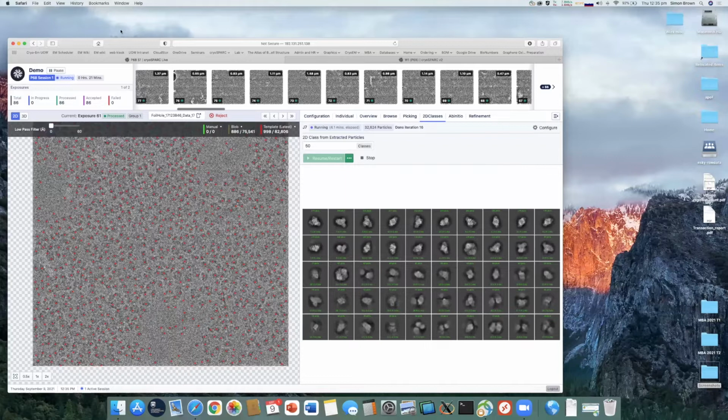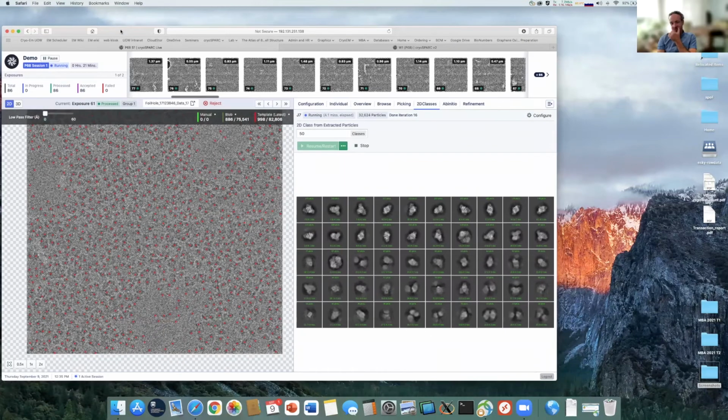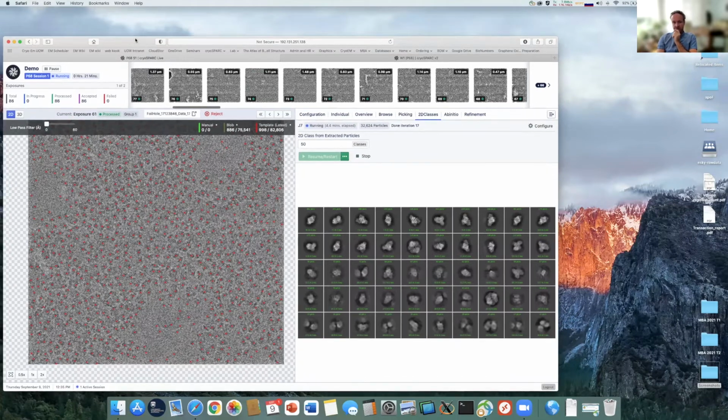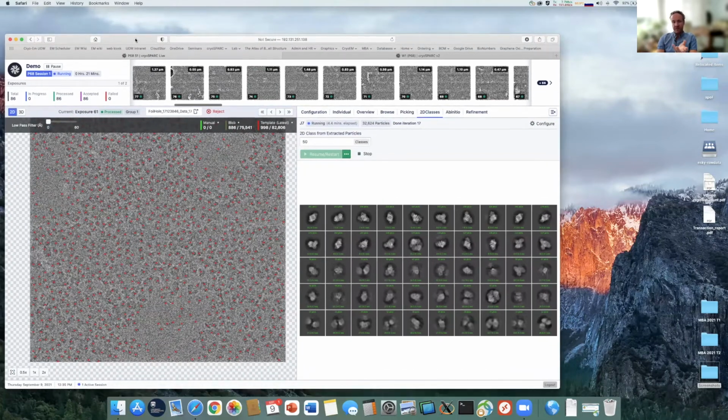Right, okay. My understanding is cryoSPARC actually isn't hugely GPU dependent, unlike Relion. Instead, it's the throughput of the files which makes a really big difference. Hence when we spec'd up this machine, thanks to Jason, we built a machine which was highly dependent on the SSDs. So we have that large SSD space, so all of our projects can sit on the SSD, but also we have an extremely fast cache.